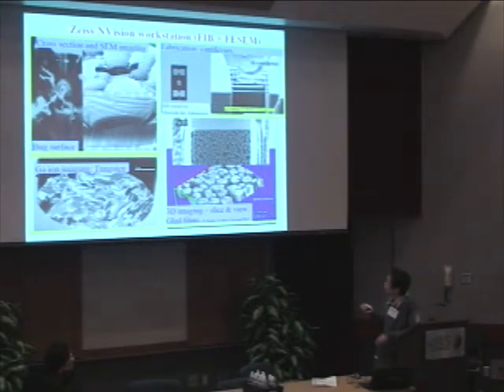Since we have a dual column, you can cut and also view by SEM. You can take a series of images by cutting through your sample. After you stack them together and do a reconstruction, you will get a 3D image through your sample.